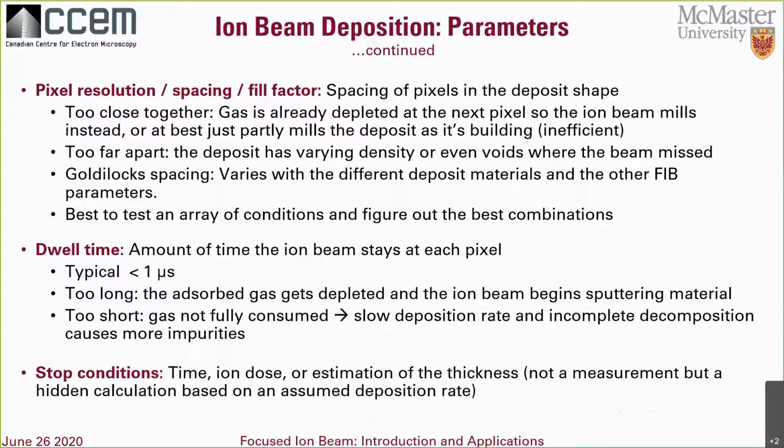Okay. What is the best spatial resolution achievable in the ion beam patterning? Okay, so this is going to depend on your microscope and how perfect the alignments are. My FIB's a bit old, so I don't think I would be able to mill a line with a width thinner than, say, 45 nanometers. Newer gallium microscopes can do quite a bit better than that, maybe up to 30.